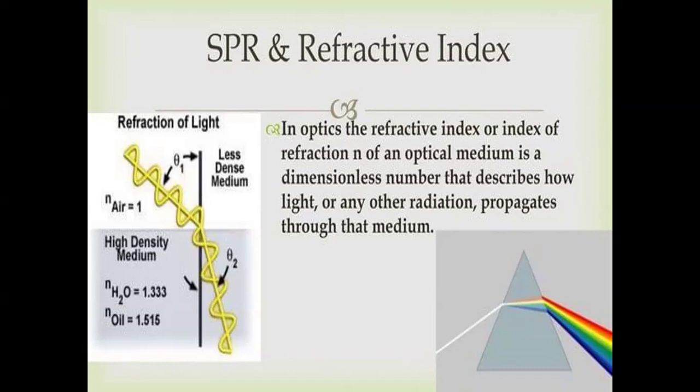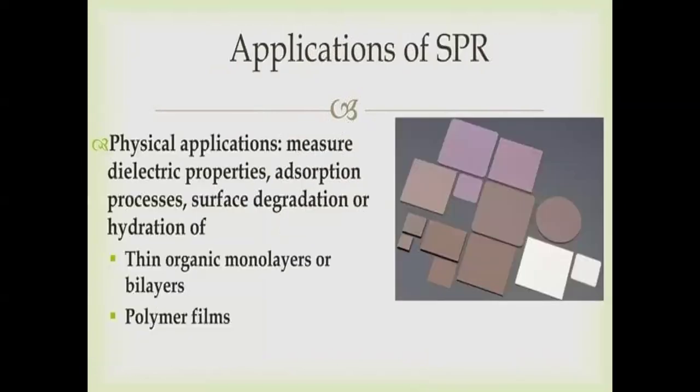the machine, or else your sensor will have a lot of noise, that is unwanted signal pickup, which may lead to inaccurate measurements. So the medium density where your antibodies are coated, or enzymes in that case, along with what material is present, all that, the reflection and refraction will change based upon the density of the medium. So that has to be taken into account for accurate measurement.